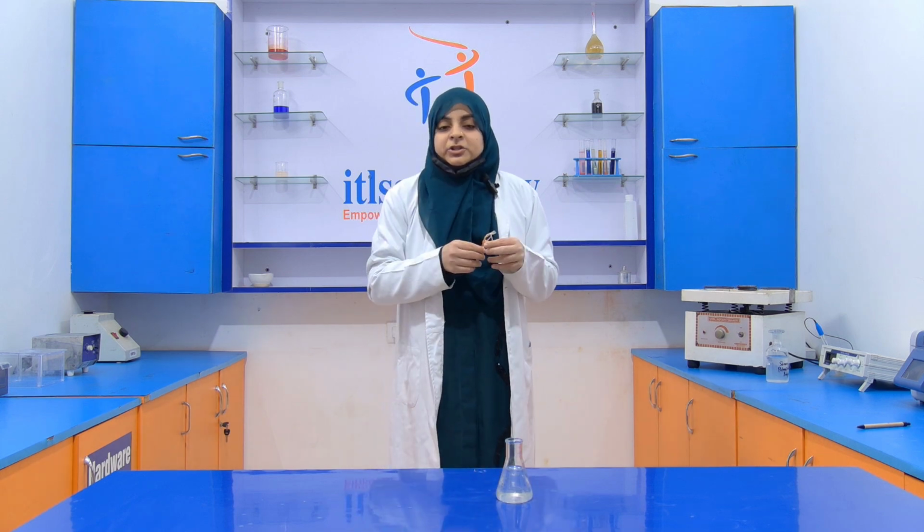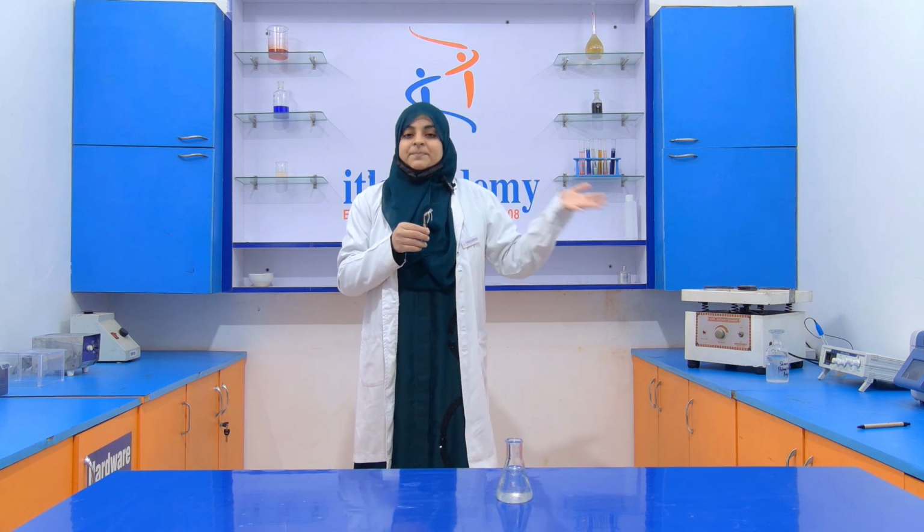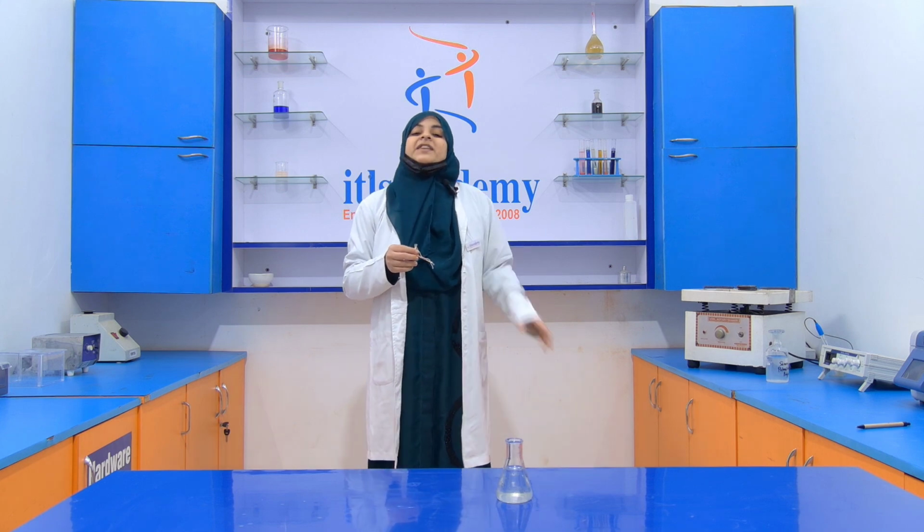But if any impurities are present, for precaution we do a centrifugation, and then we get our dialyzed protein, and it is ready to use for another experiment, that is your ion exchange experiment. So this is all about the purification of the protein by the method of dialysis.